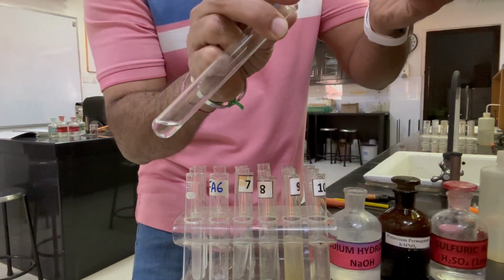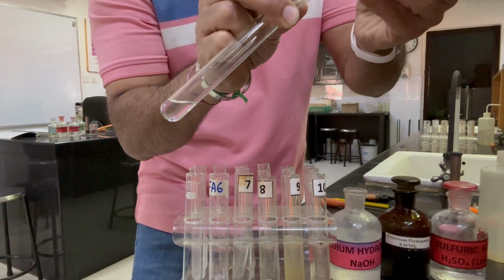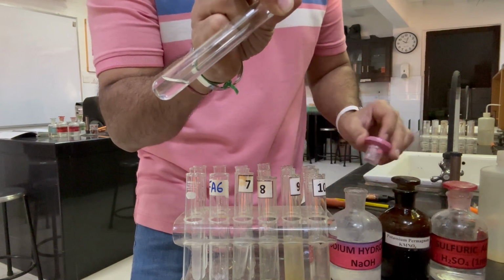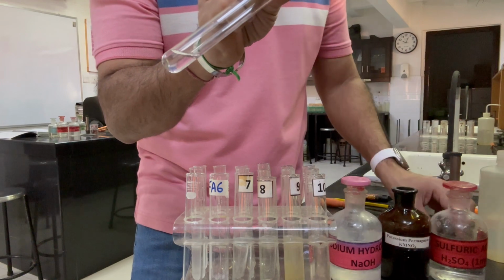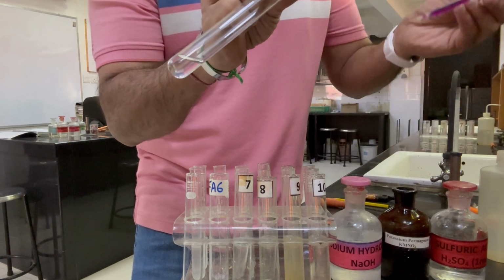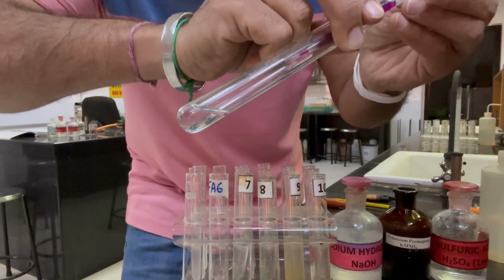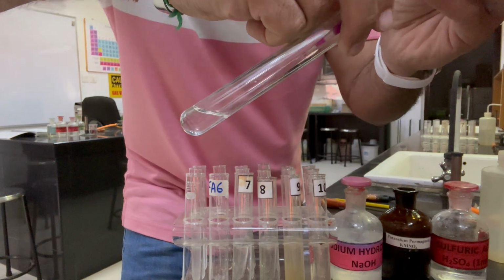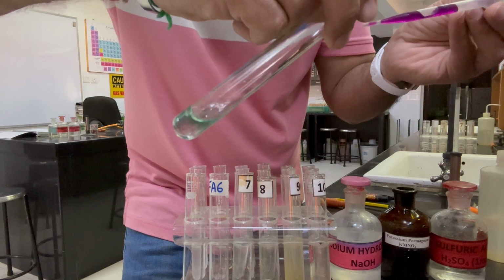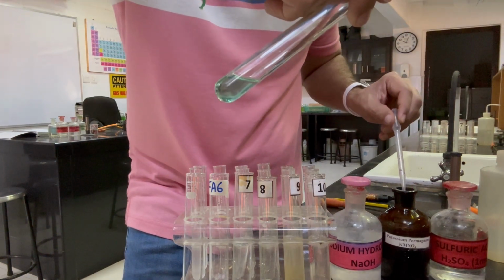As soon as we add aqueous sodium hydroxide in equal volume, we can see no visible change is coming up. Now let's add potassium manganate, and if we add a few drops of potassium manganate, we can see a green solution is produced. So the color changed to green.